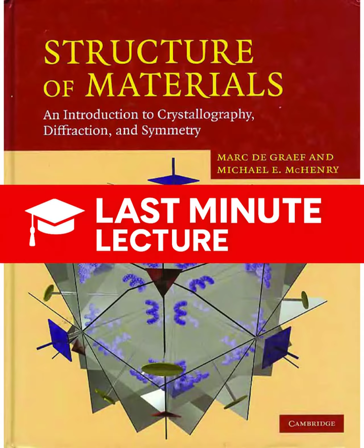When Bragg's law is satisfied for a particular plane, say the 111 plane, all the randomly oriented crystallites reflecting at that moment do so symmetrically around the axis of the incident beam. This creates a cone of diffracted radiation. A full cone? A full cone for every set of planes. And those cones intersect the cylindrical film to produce symmetric arcs or rings. So the analysis becomes a simple matter of measuring a physical distance on the film itself. Precisely. The diffraction angle 2 theta is measured by the distance between corresponding arcs on the film. Since you know the camera radius R, the relationship is purely geometric. It was a robust way to get quantitative data from a piece of film.